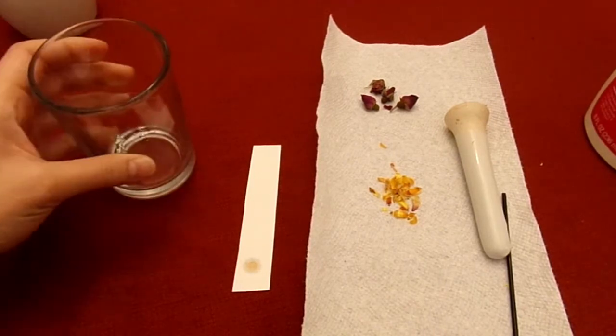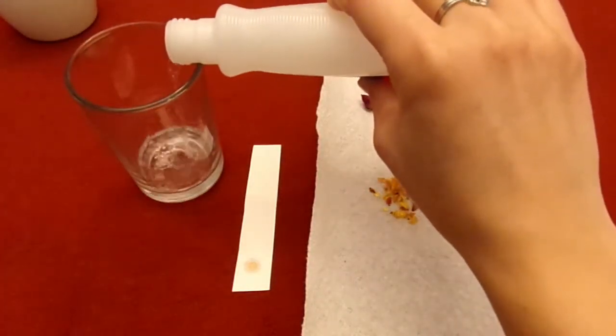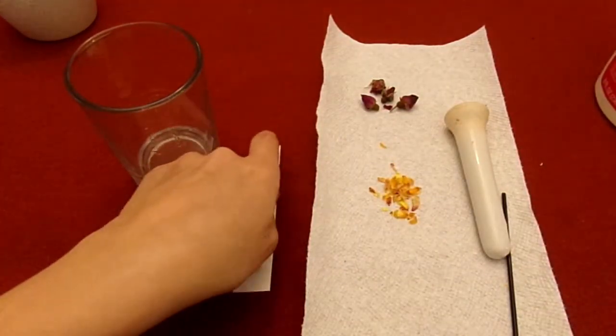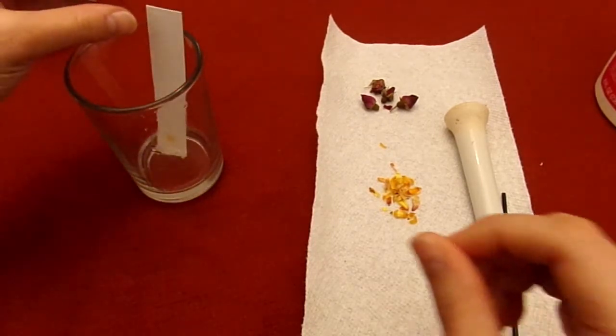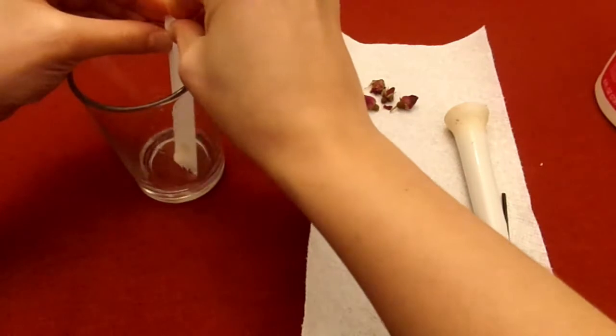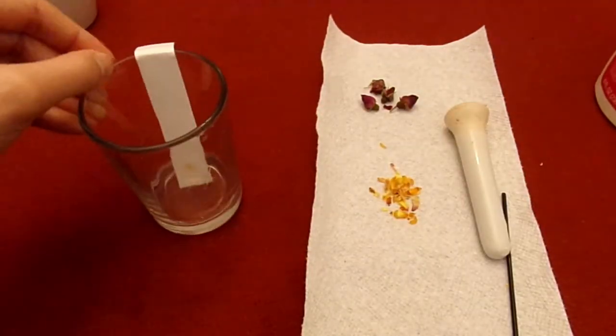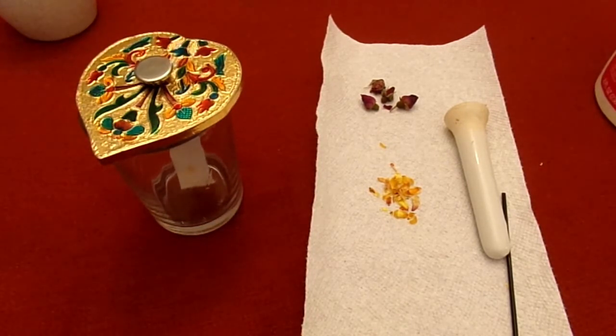Then take your jar and fill it until it has about a quarter of an inch of acetone in the bottom. Take your paper strip and add it to the jar. If it's too long you can bend over the top. Then place a lid on top and wait for the liquid to travel up to the top of the paper.